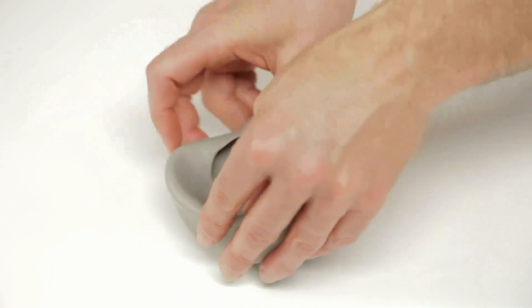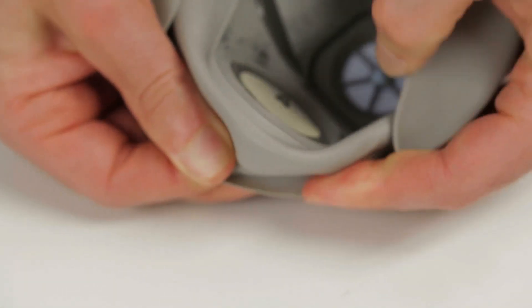To remove an existing inhalation valve, grasp the valve and pull it off the center post.